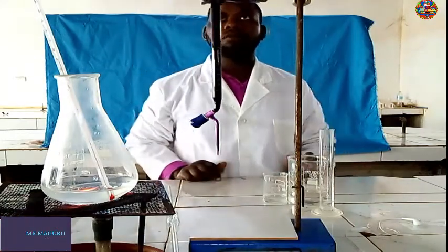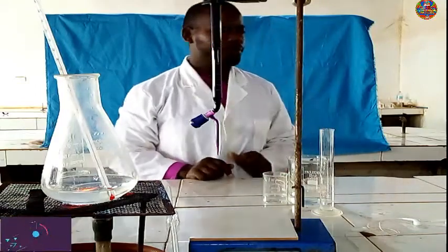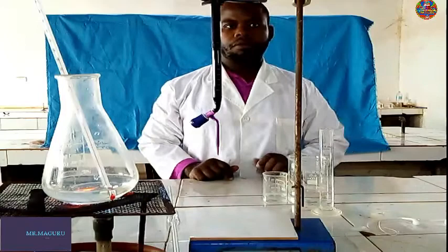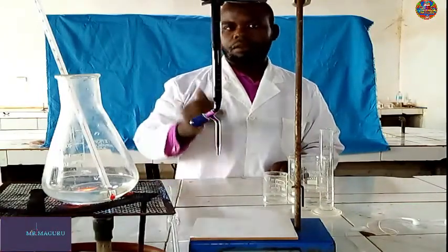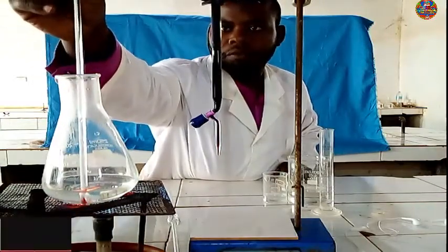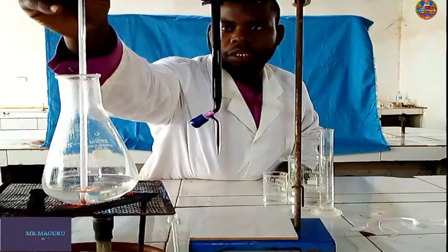The initial volume is 0, that is 0 volume of permanganate. And then we wait for the solution to reach 70 degrees Celsius.